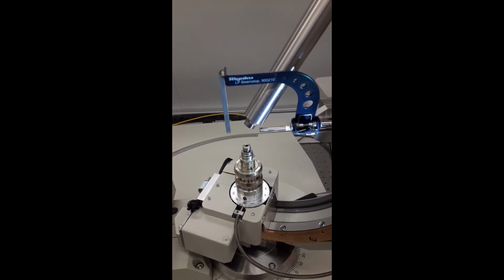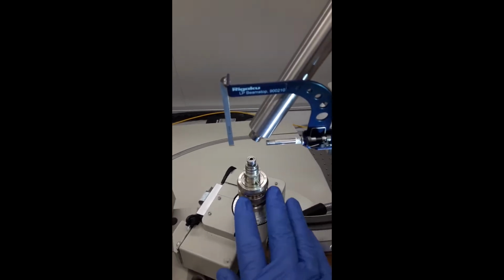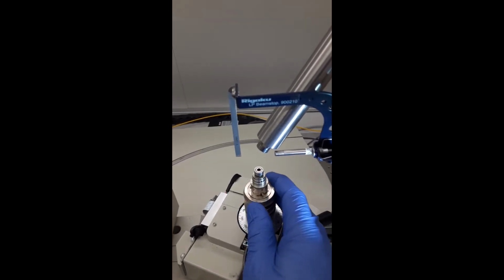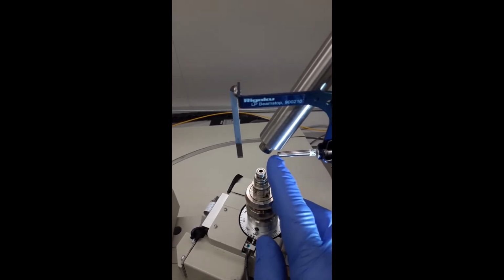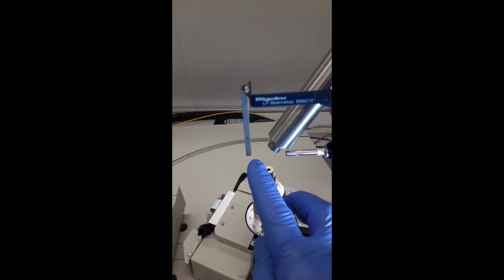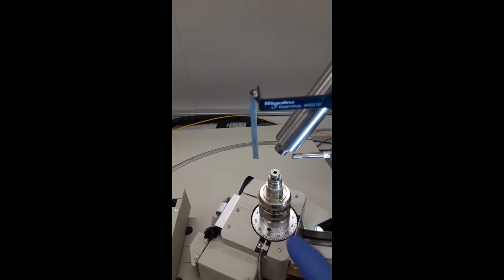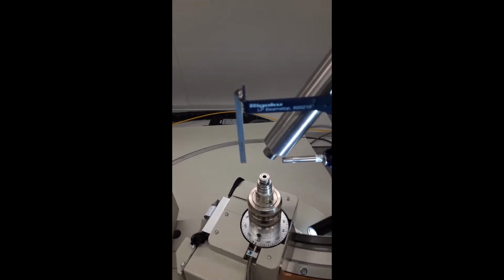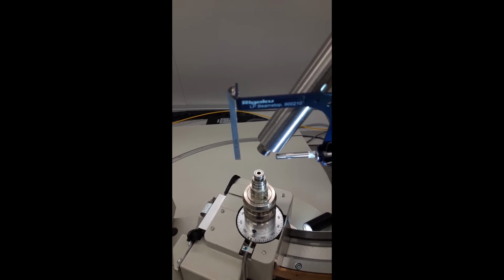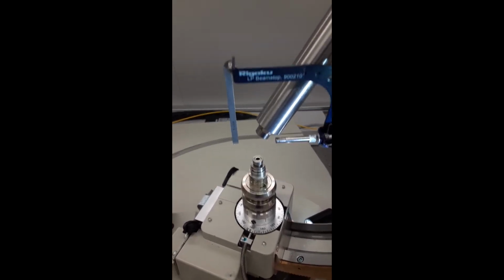Okay, this is the goniometer where the sample is put, and this is where basically all the action happens. We have the goniometer here, which is adjustable, and also we can rotate it manually, or the computer will rotate it during the experiment. This is the end of the collimator where the X-rays come out. This is the beam stop to stop the direct beam, and this is the cryo stream, which continually emits a stream of 100K nitrogen, which keeps the sample frozen, which does several things. It keeps it from drying out, and also keeps it from slipping, and also reduces the amount of radiation damage from the high intensity X-ray beam.